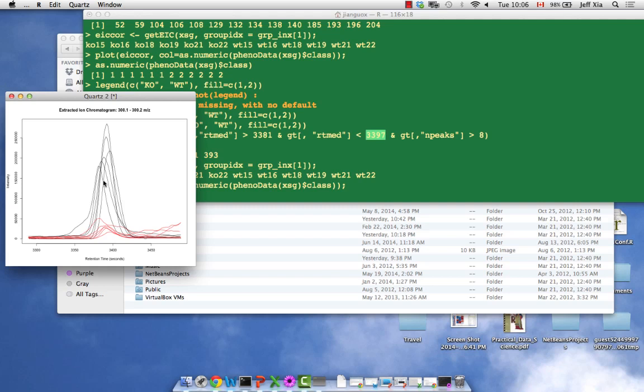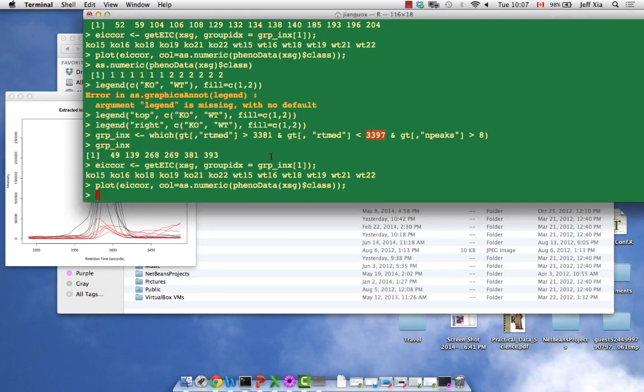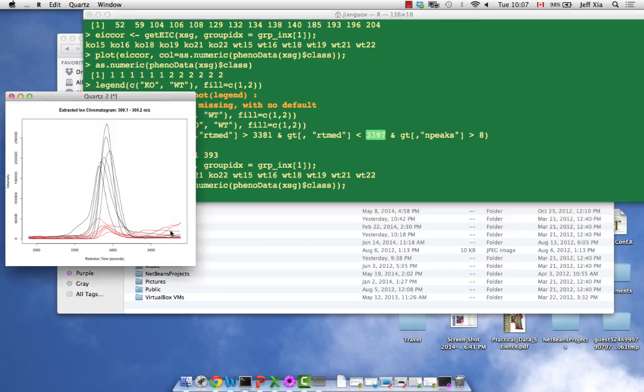So the peaks are not supposed to be perfect? Oh yeah, they should be, but I think sometimes it doesn't do the job you want. It's ideal. So in the best scenario, we should see all the peak effects overlap together, right? Yes, position-wise, but height will be different. So the previous one looks nicer, right? This one is slightly odd. Yeah, it depends.